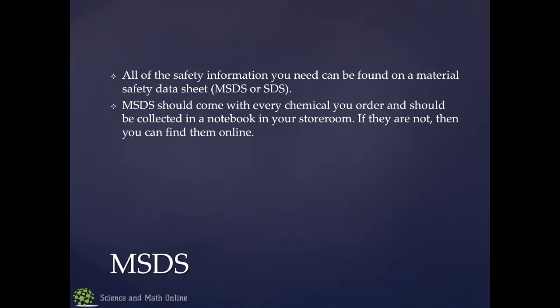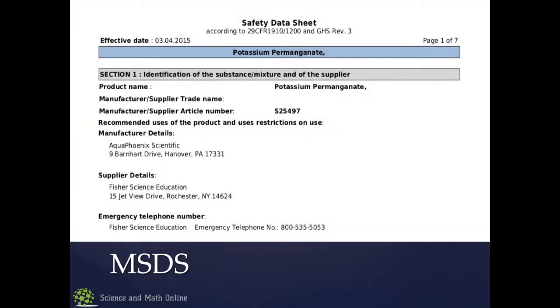That way you can always have it, and it'd be good to also have an online PDF version of it as well. I have mine, like I said, and I've got key sections highlighted. So with material safety data sheets, you pick one up and you'll see something that looks like this. This is the beginning of the first page. They are long. They're usually like 5-6 pages long. This one's 7 pages.